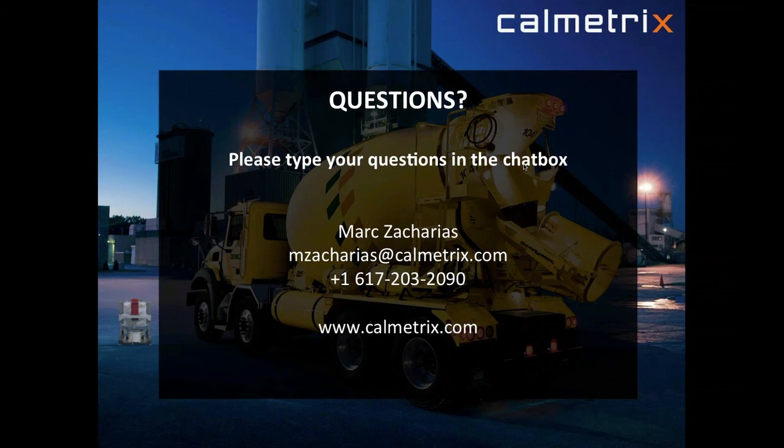So the correlation is not only between what you measure in the Pheso Rheometer and what you see in an industrial size mixer; you would typically have the same behavior, because this attritor impeller is very similar to what you would see in mixing devices.